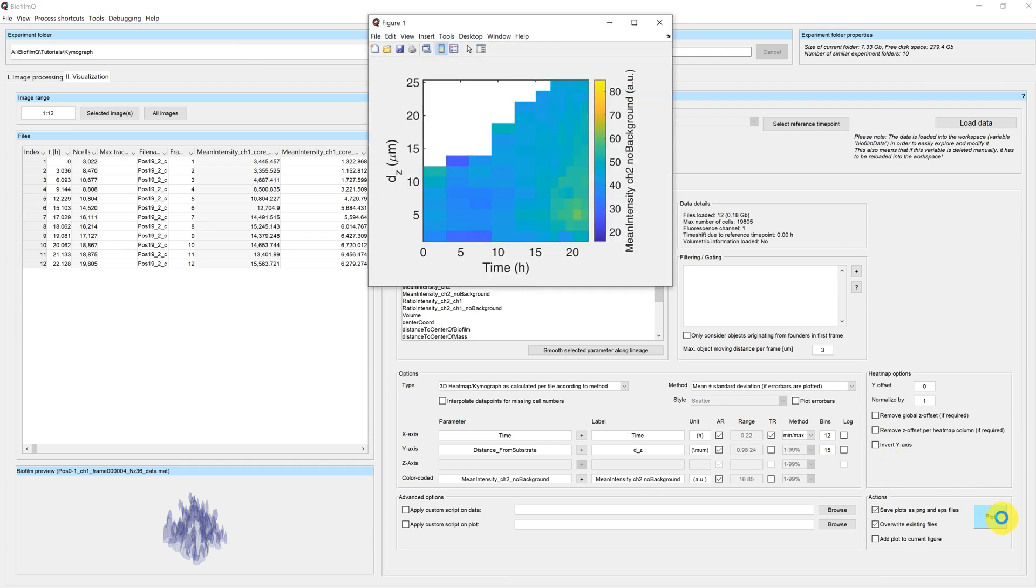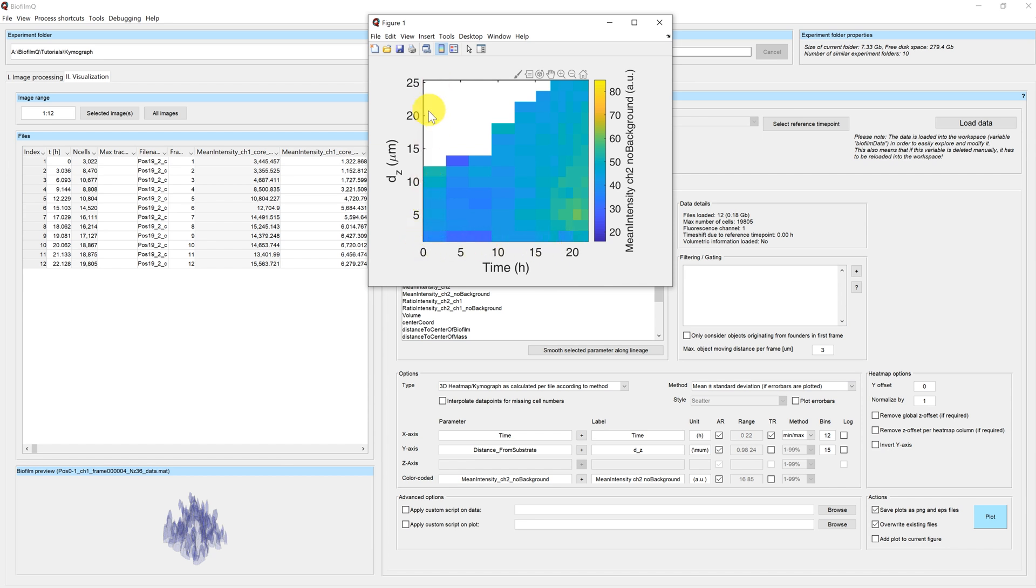If we now plot this, you can see the biofilm development over time. We now have the axis time here and our spatial axis is the biofilm height.